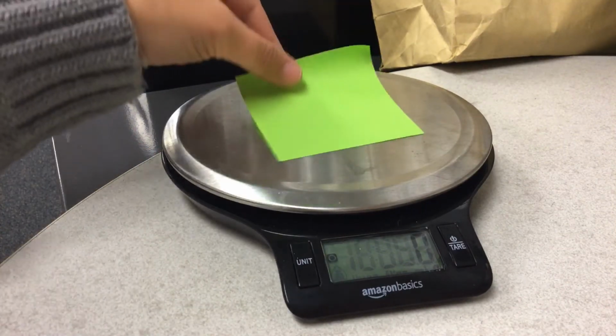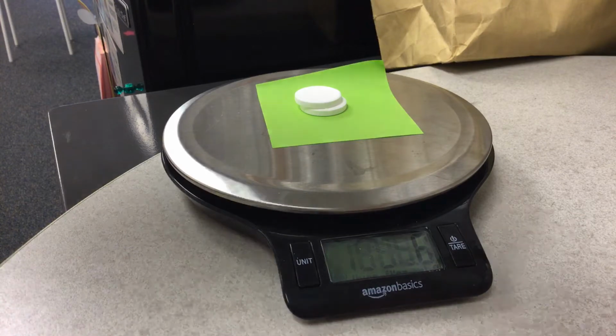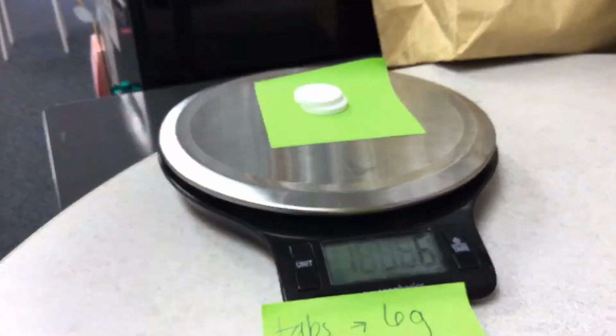So the first thing I'm going to do, and I'm just putting this paper down here, is I'm going to add these 2 tabs of Alka-Seltzer. And it is saying that it is 6 grams. So I'm going to write tabs, and we're going to put 6 grams just so that we can remember this, okay? So our Alka-Seltzer tabs weighed 6 grams.